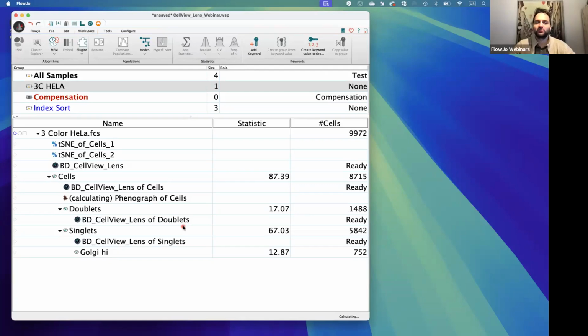Sorry, I did some pre-work just to show you that those tools also work with the SA data here. What I'm going to do next is create a new image set of cells that are in close contact. I'm not going to use the term interaction, because I don't know if they're really interacting.